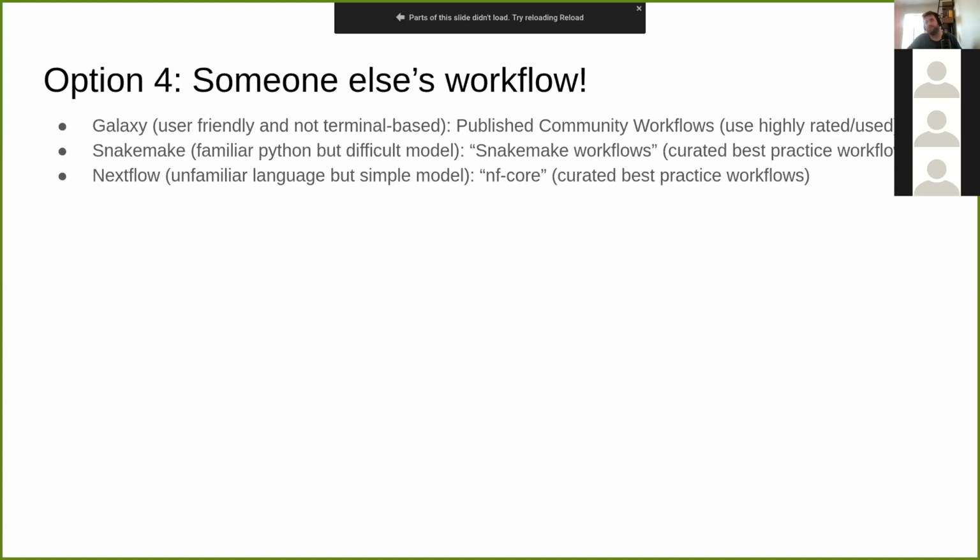So depending on your problem, I would look into those to see if there's already a workflow that exists to do your problem. Particularly for this, there are a few workflows in there, with pictures that haven't loaded for some reason. One is Torsten Seemann's Nullarbor, which will go all the way from reads to generate a nice interactive report containing AMR genes, for example. And the other is Bactopia by Robert Petit, who I forget where he's based.